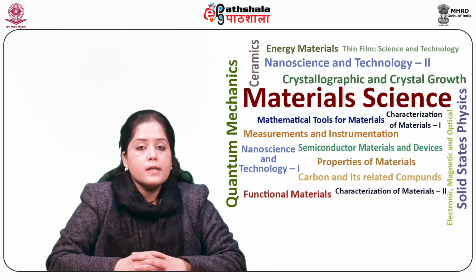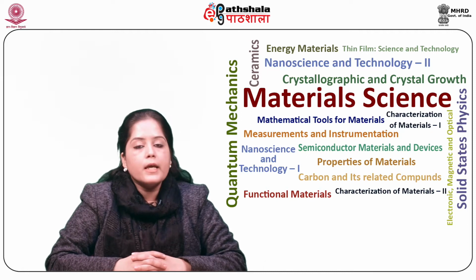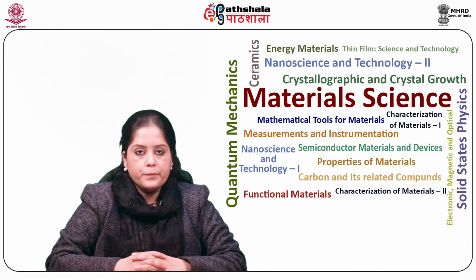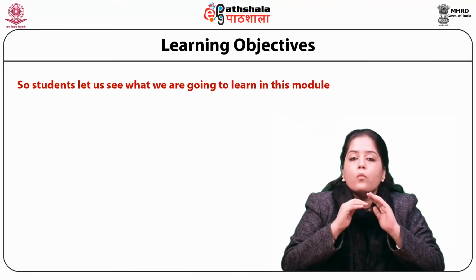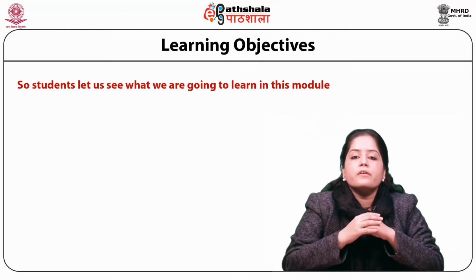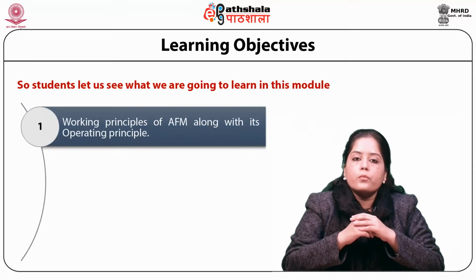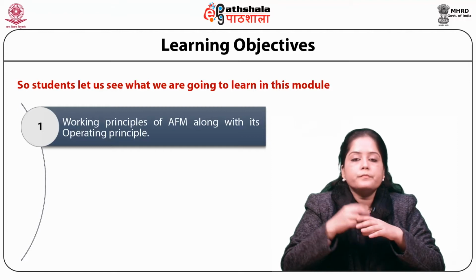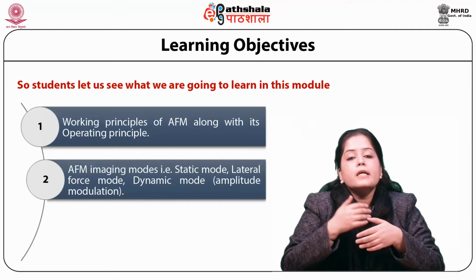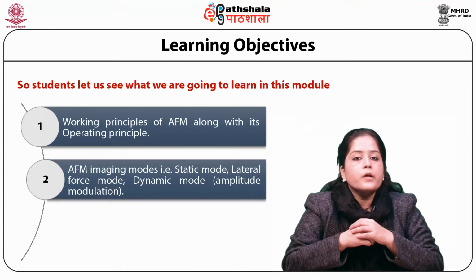Today we are going to discuss the module Atomic Force Microscopy (AFM) from the paper Thin Film Science and Technology. So students, let us see what we are going to learn in this module. First, we will discuss the working principles of AFM along with its operating principle. Second, the AFM imaging modes, that is static mode, lateral force mode, dynamic mode or amplitude modulation will be discussed.